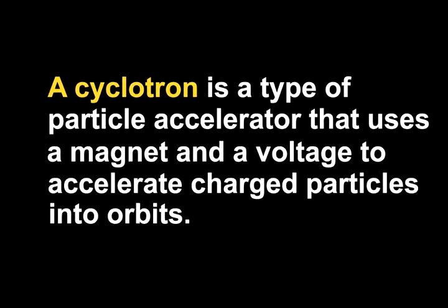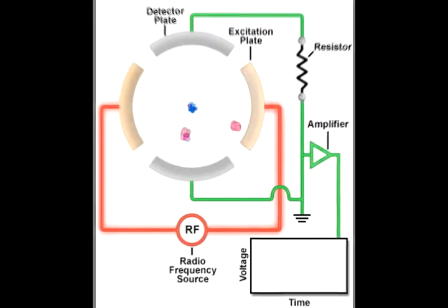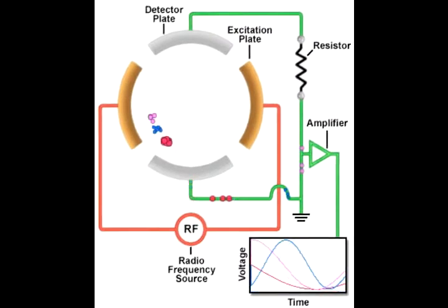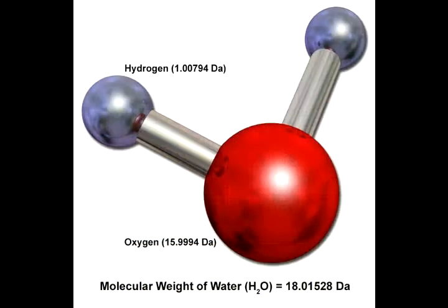We're chemists and biologists, and we want to find out what molecules are in mixtures when there's not enough of them to study by NMR or other methods. We usually work in very tiny amounts, the millionth of a gram. What we do is basically weigh the molecules, and it turns out that every chemically different molecule has a different mass. Just like if you weighed everybody in the world accurately enough, you could tell them apart. We can tell different molecules apart.